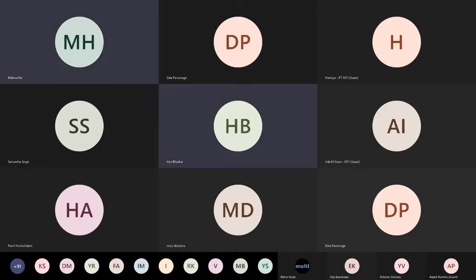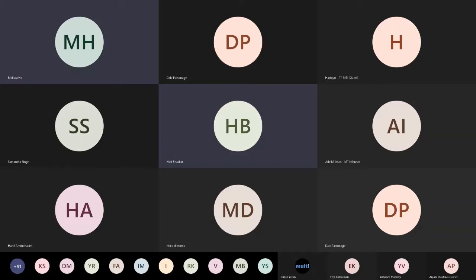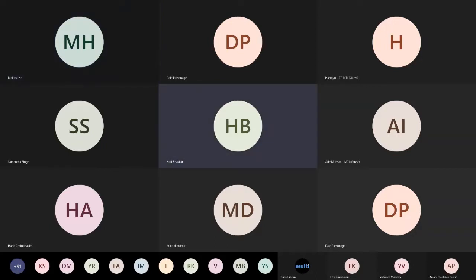And then there's a question, Harry, that's pertaining to, I think it's the UPS or the power source. So this is a question of, should we use a UPS for the Zetium? Because we use the generator for supplying the electricity here. Yes, we would highly recommend that a UPS is used, because these are analytical equipment with sensitive electronics built in. So a clean power is advised, and hence a UPS would be recommended.